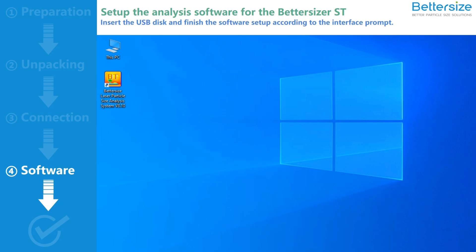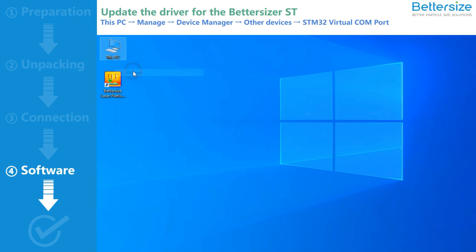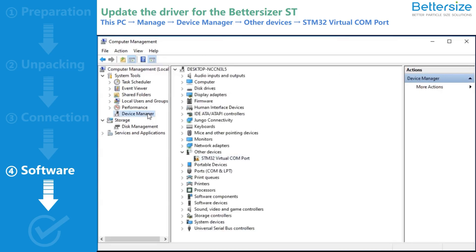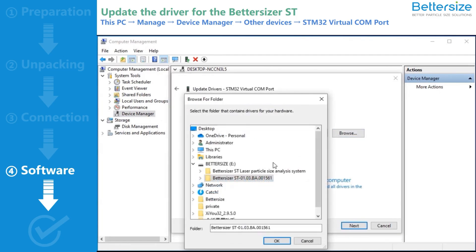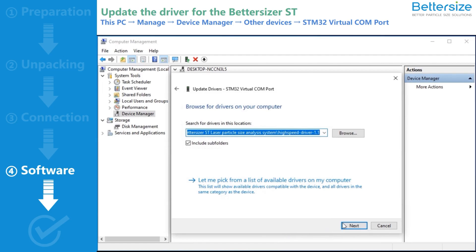After the software setup is complete, you need to update the driver. Right-click the This PC icon and select Manage to display the computer management window. Select Device Manager, then Other Device, then STM32 Virtual Comport. Right-click this option to select Update Driver, and select Browse My Computer for Drivers. Then head back to the USB disk driver and select the folder High Speed Driver 1.1. Click OK to finish the driver update.